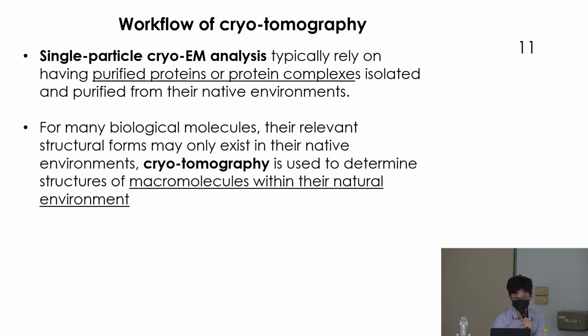So that's the major difference. One has to be purified, and this one we don't purify. We study how they react to their neighboring environment. So this sample exists in its native context. Okay?